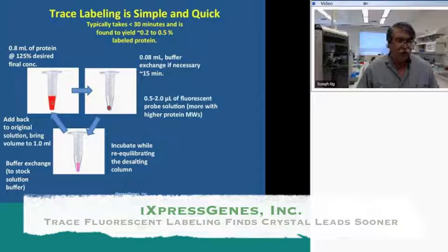Now, the solution itself will not be as intensely colored as this. In fact, I'm colorblind, so I usually can't see any color. However, other people have shown me that there is usually, for the probe we're using, a very faint color to it.